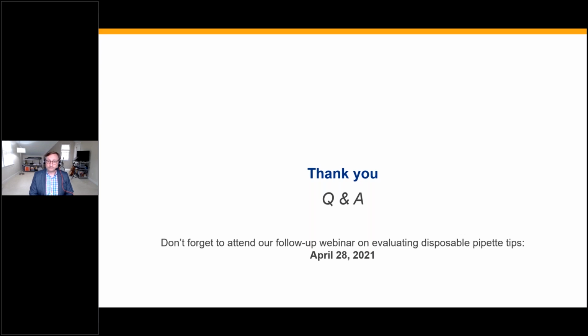It looks like we do have a question here. It's regarding liquid class and biological matrix, for example, human plasma. They're wanting to know if there is a mimic liquid. They're saying that it looks like vendors don't like working with biological matrices. Vendors don't like working with biological matrices because it's difficult.